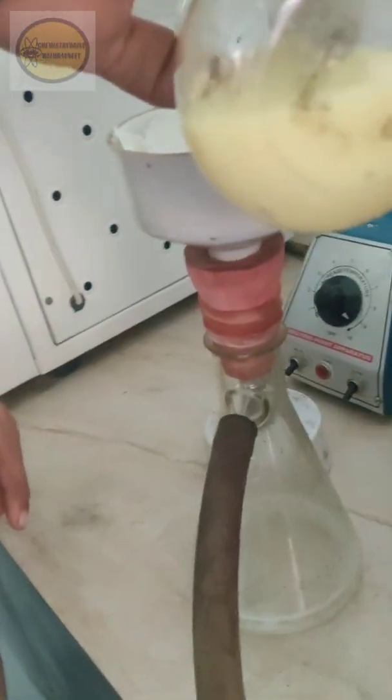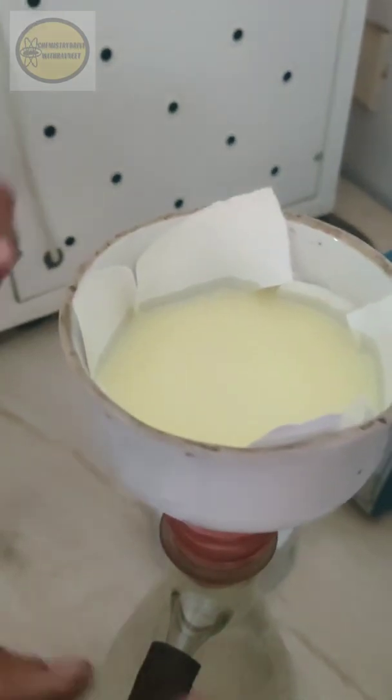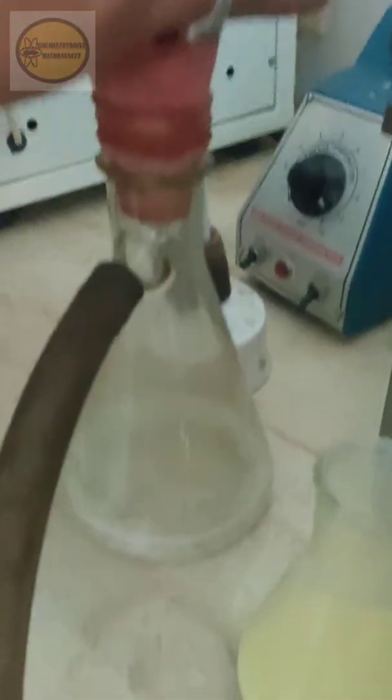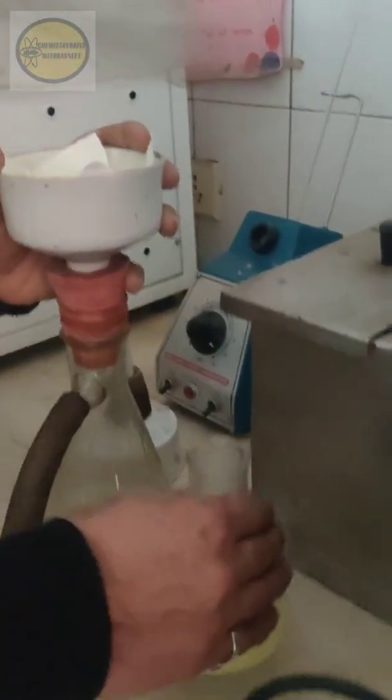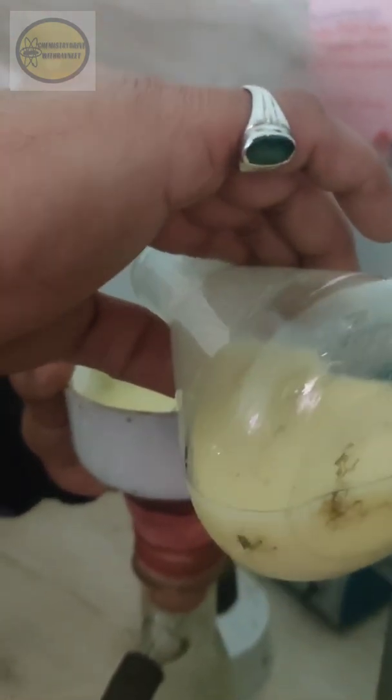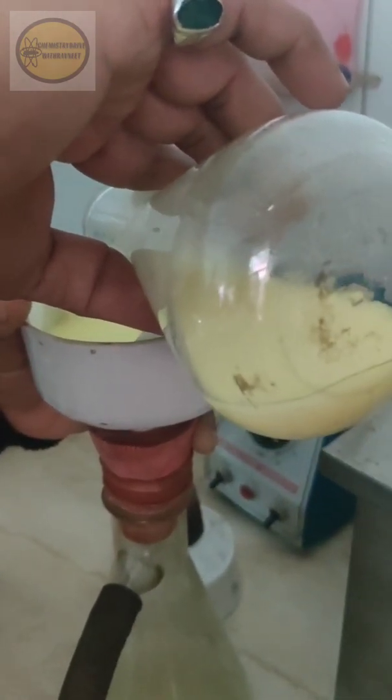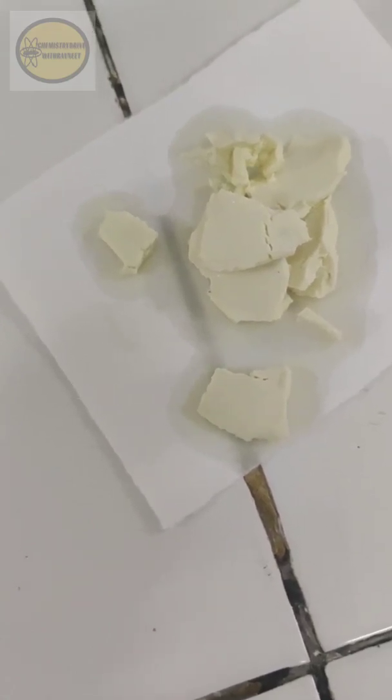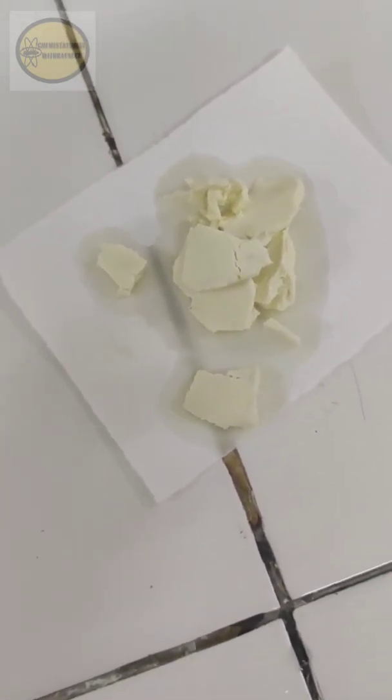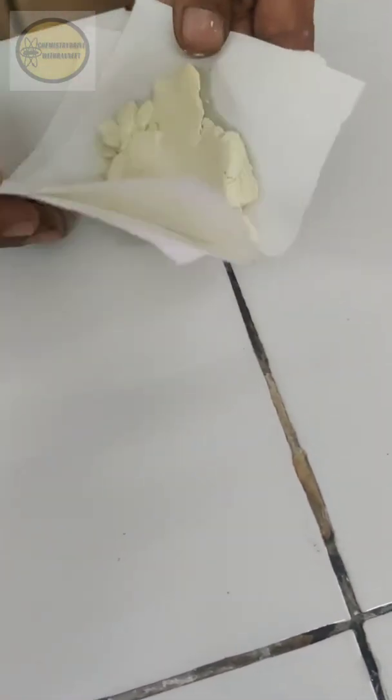Now we are filtering this whole content using Buchner funnel. As you can see the filtrate is going down and we are just obtaining our solid precipitates. So as you can see we have obtained the pale yellow crystals of para-nitroacetanilide. Now after this you need to dry it between the folds of filter paper. So dry it completely and then after that do the recrystallization.